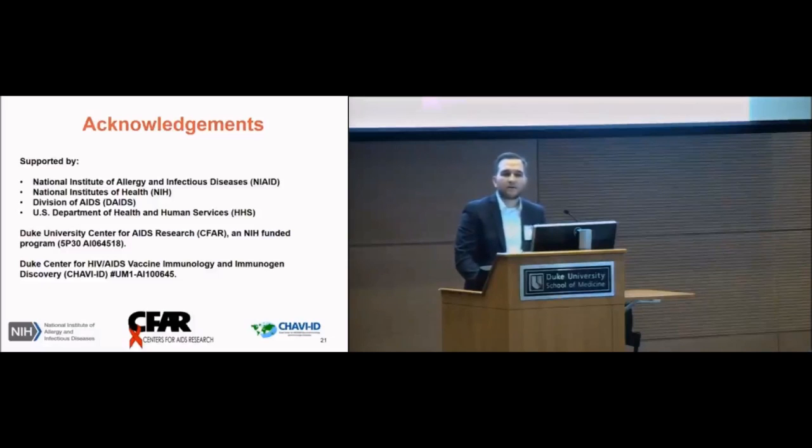So for your new technology with the paired antibodies, do you sequence the complete heavy and light chain variable region now? Yeah, so when they're linked, it's about 1,200 base pairs long. If you use the Illumina platform, we can sequence most of the V gene to get the CDR3 as well as the gene call. But if we want to make the antibodies, like in our case, we have to then prepare 2 other libraries of the full heavy chain and the full light chain if we're sequencing by Illumina. If you use sequencing like PacBio that can sequence longer, you can do that all in one read. But for our purposes, we're making 3 libraries: a paired library, a heavy chain library, and a light chain library.